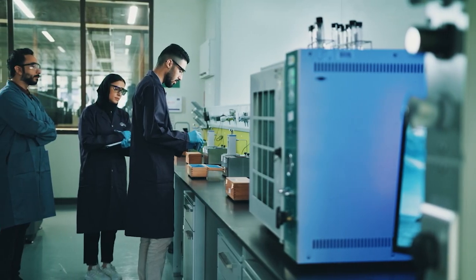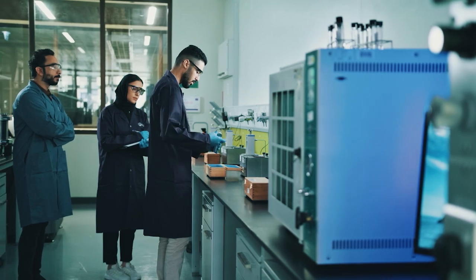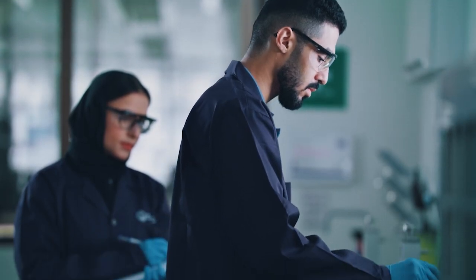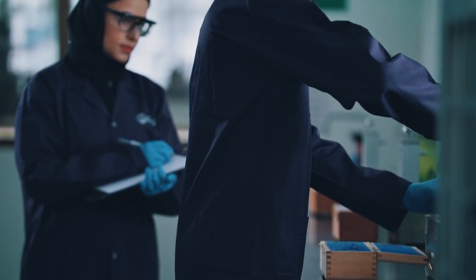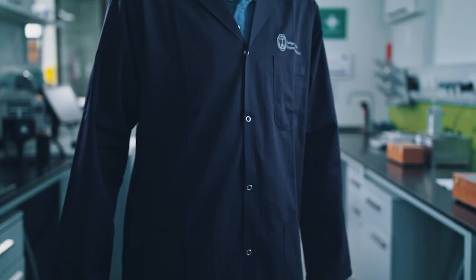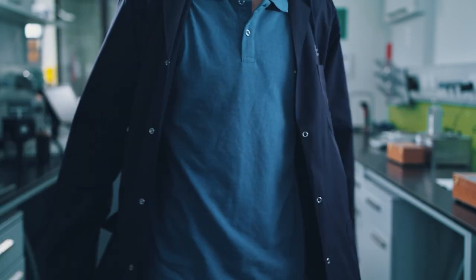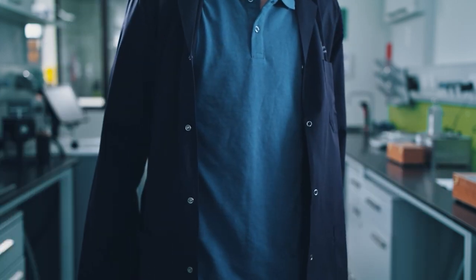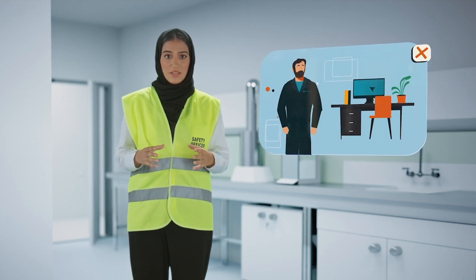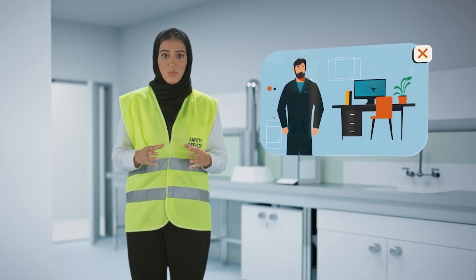Everyone in the laboratory, including visitors, must wear lab coats at all times. Lab coats should cover the entire upper body, extend to the knees, and fit comfortably without hanging loosely from the arms. The lab coat must be kept fastened when worn. Snap closures are preferred over buttons or zippers to allow quick removal in case of an emergency. Furthermore, remember not to wear it in clean spaces such as offices. A lab coat must be washed separately on a regular basis.